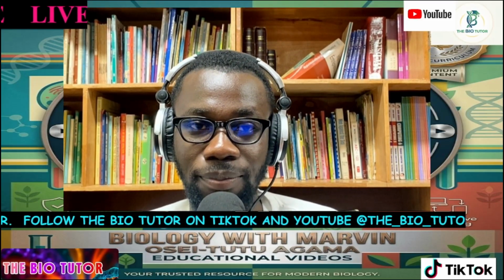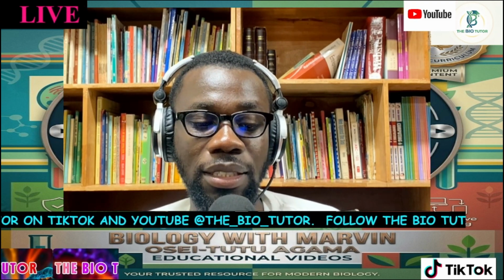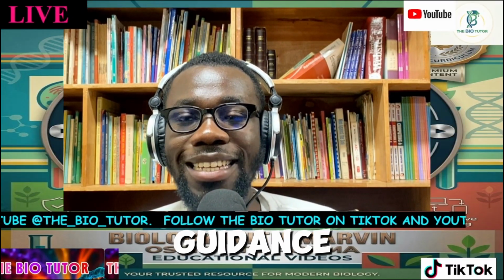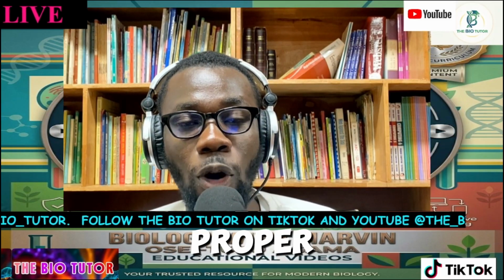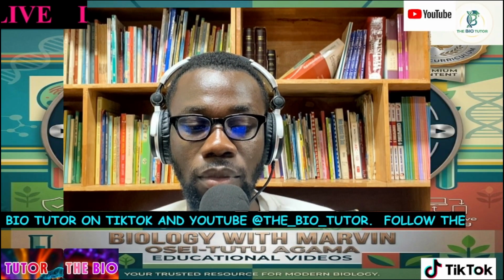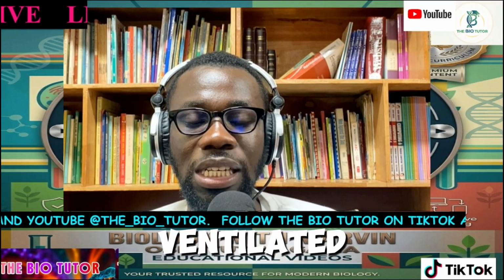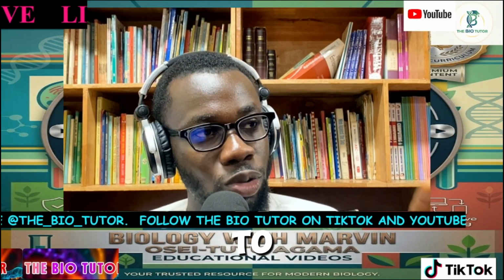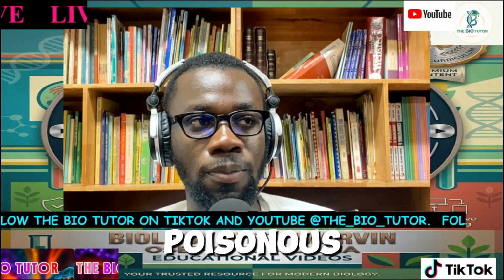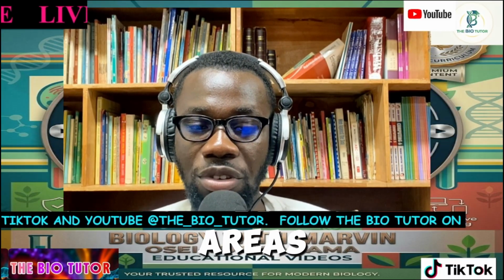Students, do not skip this. The next one, ask your teacher for guidance on proper use of the stain. And the last one, use stains only in well-ventilated areas. So you don't go to one corner where there is no ventilation. Because remember, we are saying it is poisonous. So use stain in well-ventilated areas.